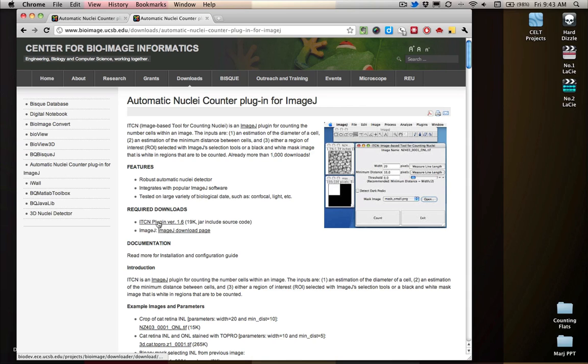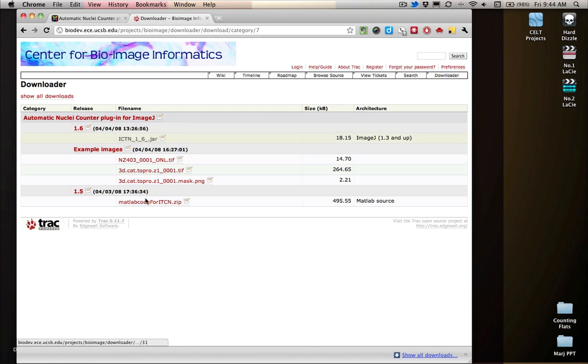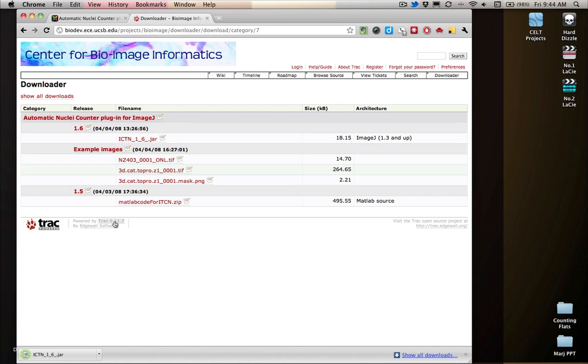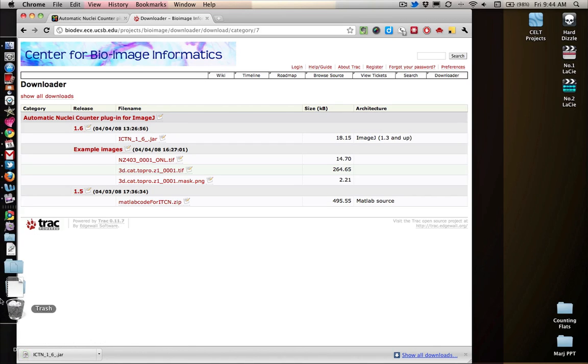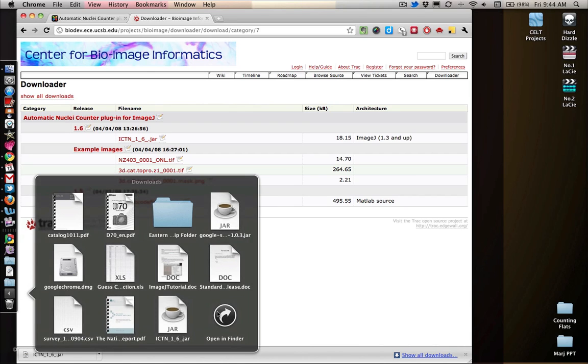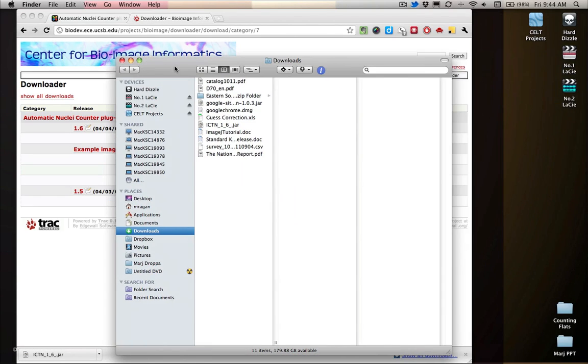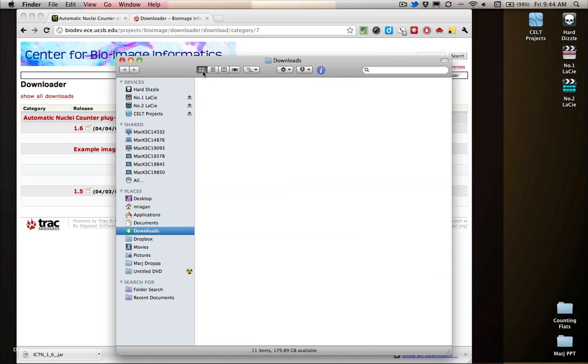You need to download this jar file. A jar file is a Java file. What will happen is it will take you to a page like this. You'll say that you want this, it will download it into your downloads folder for you. In your downloads folder, you should be able to find it. It might have a little picture of coffee on it because it's a Java file.